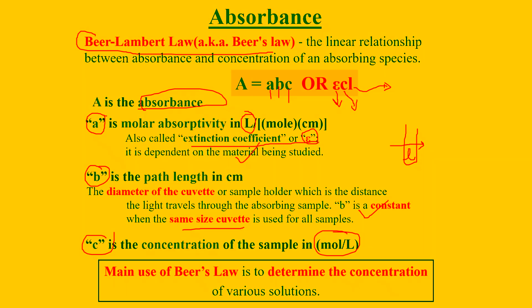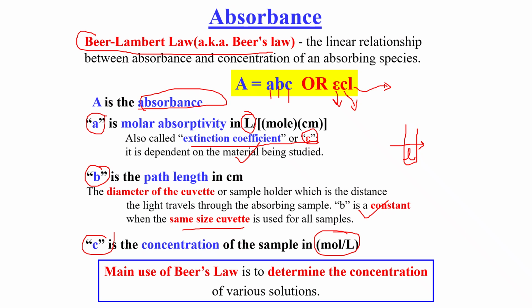Now we will see some questions related to Beer-Lambert's law in the next session.